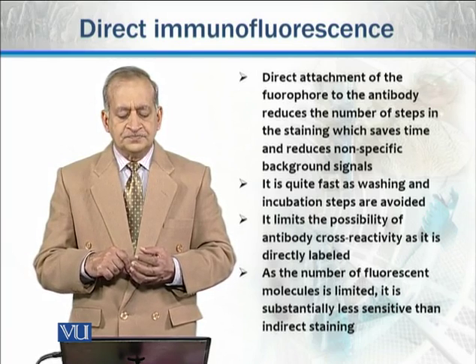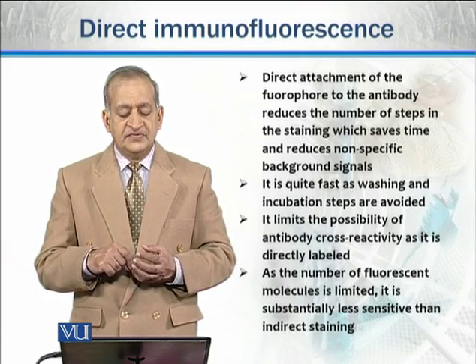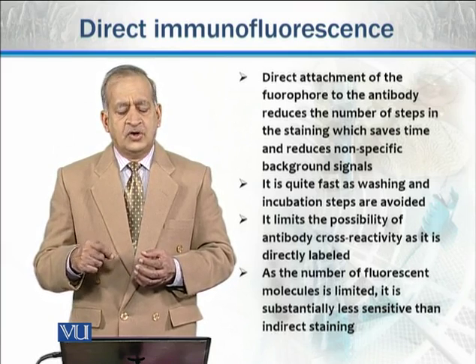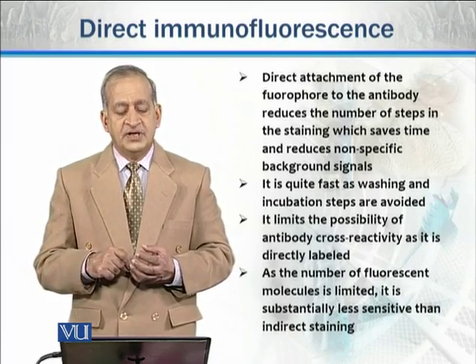And similarly, as the number of fluorescent molecules is limited, it is substantially less sensitive than indirect staining. So this is a disadvantage or limitation of direct immunofluorescence, that it is less sensitive as compared with indirect staining.